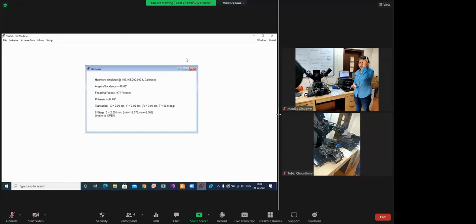Many people will ask why we are not using any special glass. Actually, none of us work on thin films, so right now we do not have any sample which is very precise for thin films. We have simple glass, so we are using that. If you have borosilicate glass or any specific glass, the roughness will be less in them. We'll also show this simple glass roughness, how you can calculate the roughness of your simple glass.